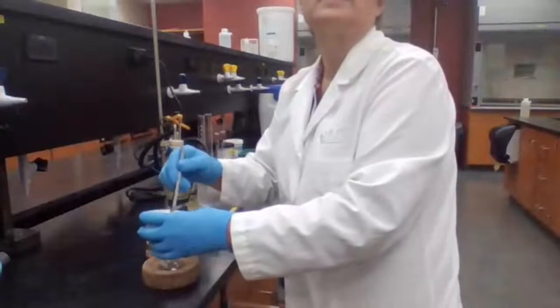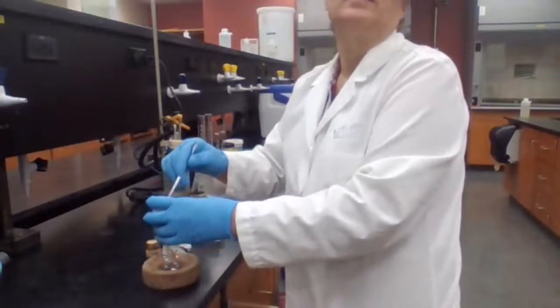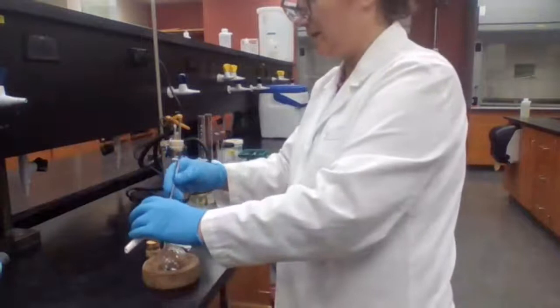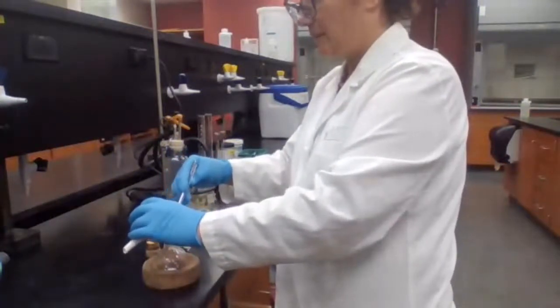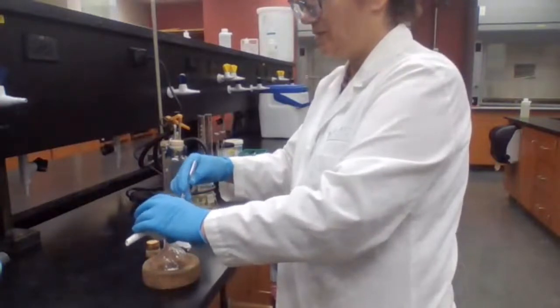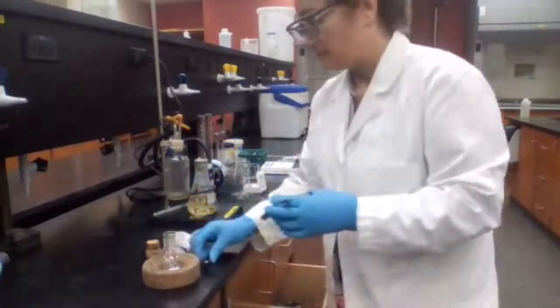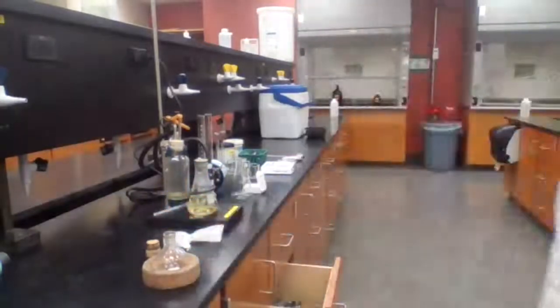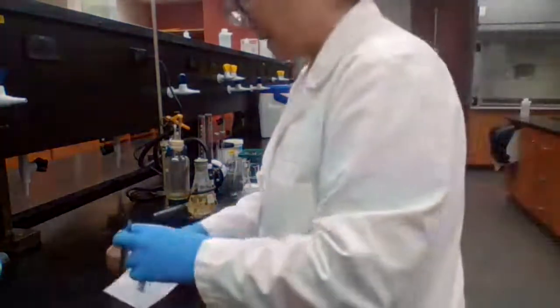And you're writing the next step, simple distillation. Okay. So we are practicing extraction. We are practicing distillation. We are practicing all the techniques today.